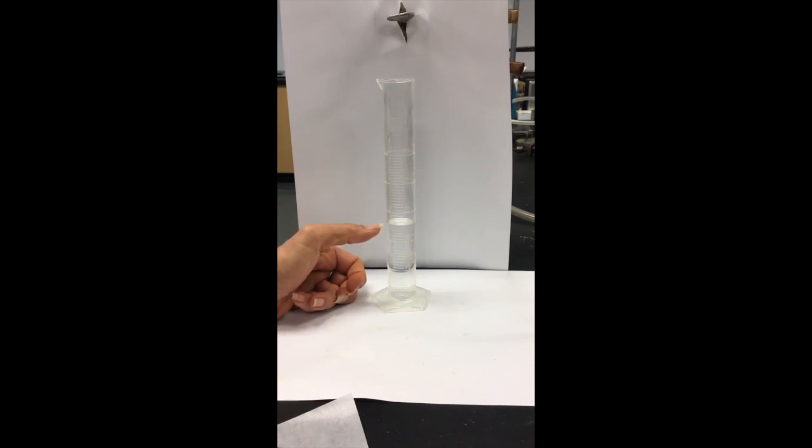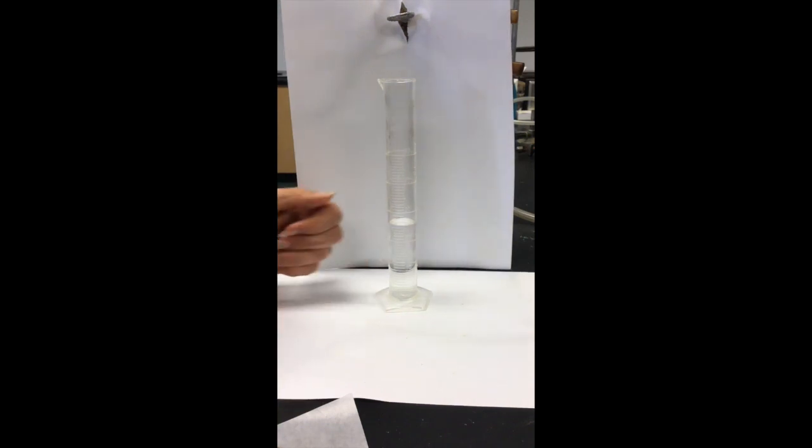What's important here is you record the exact volume. When you're reading the bottom of the meniscus of your water—that's the curvature part—you want to make sure you're looking at where the line is touching. You want to read that at eye level, so I am bending down to look at it, or I could lift it up to my eye level.